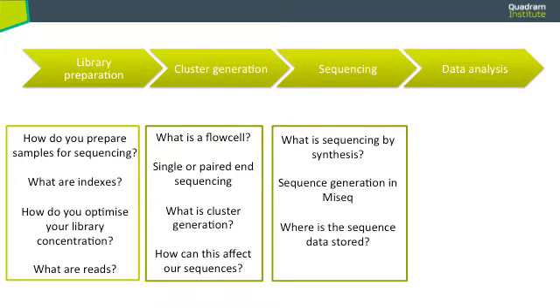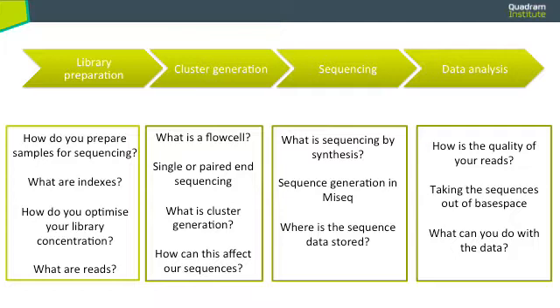And coming to the sequencing, which is an Illumina signature, sequencing by synthesis, then sequence generation in the MiSeq specifically, and how the sequence data is stored. I will talk a little bit on data analysis, but more of it will be continued by my colleague, which will be mostly on the quality of your reads, how you take the sequences out of BaseSpace, and what you can do with the data.